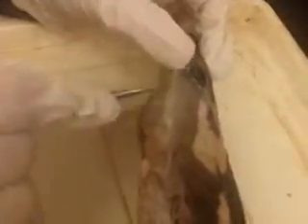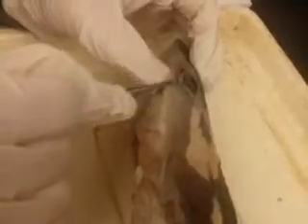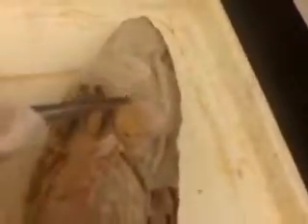It inserts into the Meckel's cartilage, joining the adductor mandibulae, and it is homologous to the adductor mandibulae in the necturus. The next is the intermandibularis. Now we removed a lot of this, but a lot of it is still here. Here it is, the intermandibularis, right there.